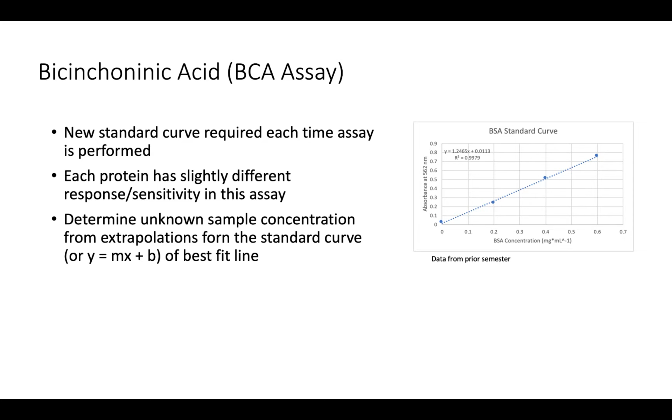After you've got your BCA set up, dilutions made, and all of your unknowns prepped and in the oven, I would start to set up for your activity assay. I don't recommend trying to start performing your activity assay in that 30-minute period. Just get everything really well set up because you want to be nice and relaxed when you pull the BCA out to do those measurements.